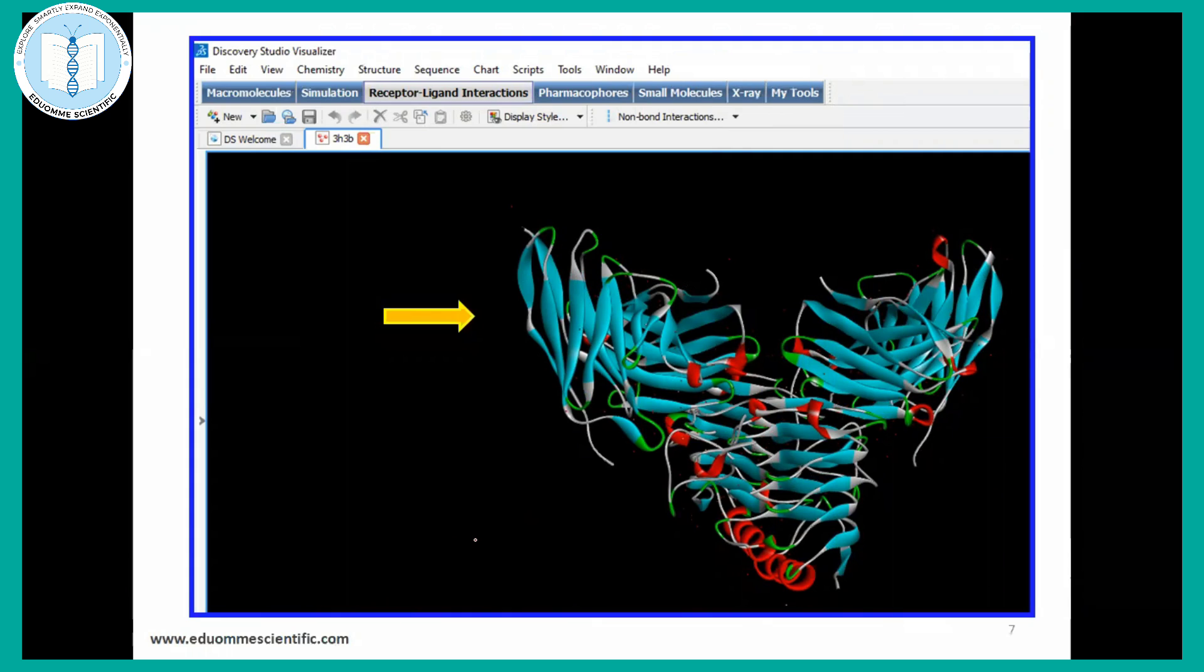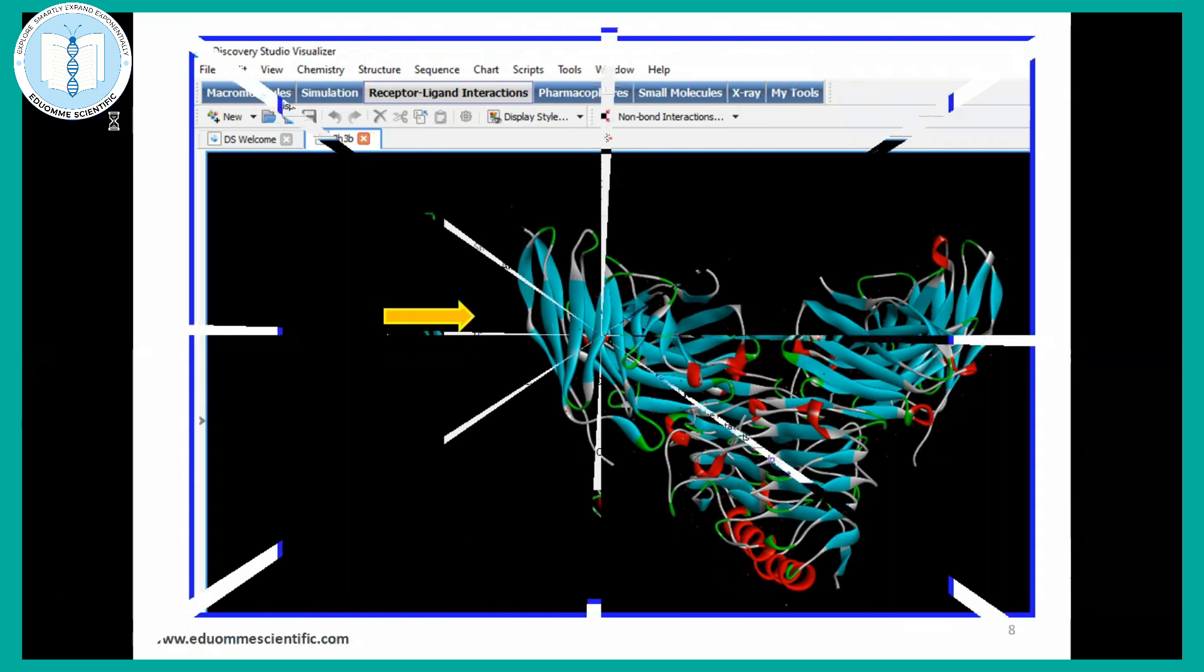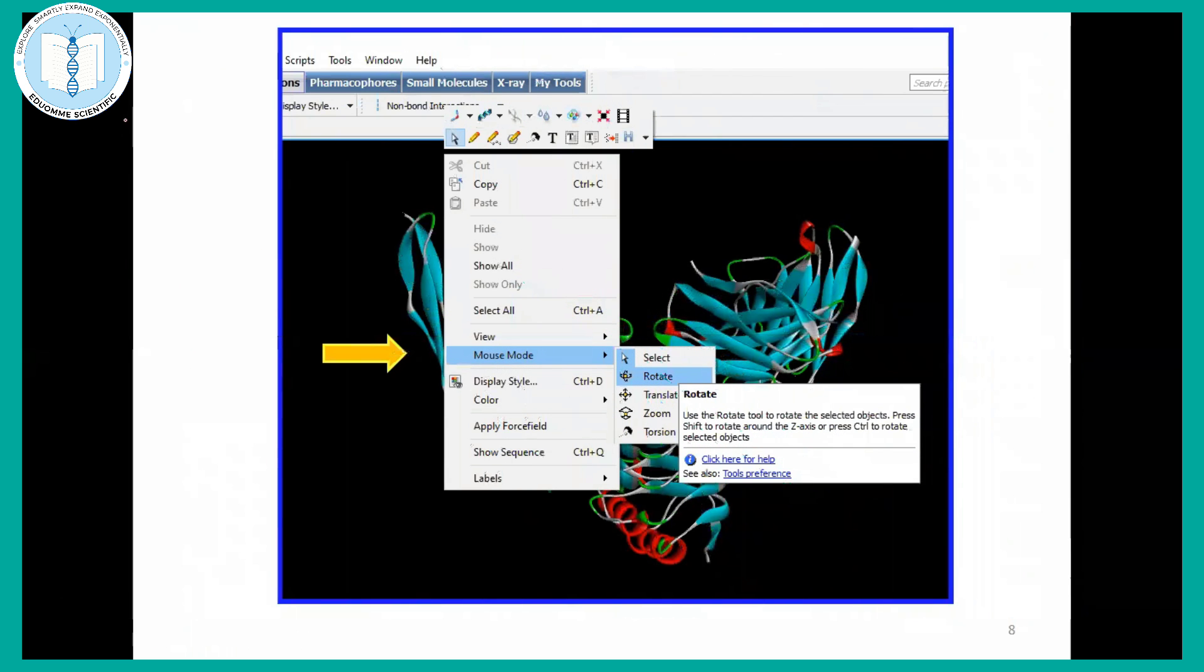After getting the PDB, you have to download this file and then you can open in your Discovery Studio for visualization. You can either type out the URL or you can type out the PDB or you may store the file and then you can go to file section and open the file.